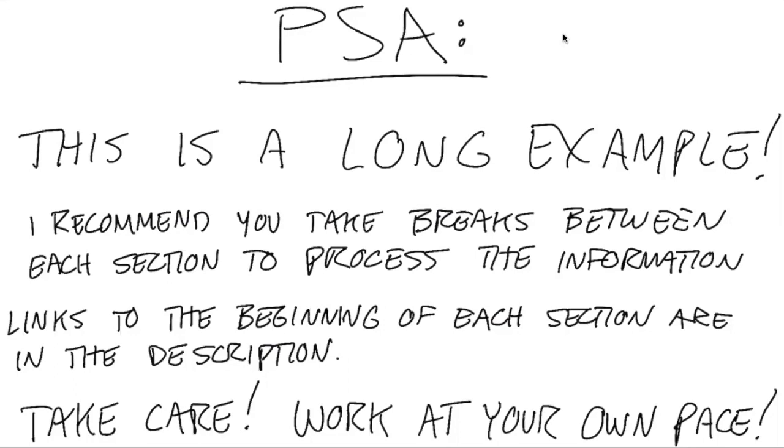It's probably going to be best for you to take breaks in between each section of proton, carbon, HSQC, COSY, to sit back, process the information, maybe come up with some guesses for yourself. When I sit down to tackle a problem like this from nothing, having never seen it before, I don't sit there and work until I've solved it. That is absolutely not how I approach these types of problems. I dive in, look at little bits of data here and there, get some ideas started, and then normally I'd take a break and go do something else.